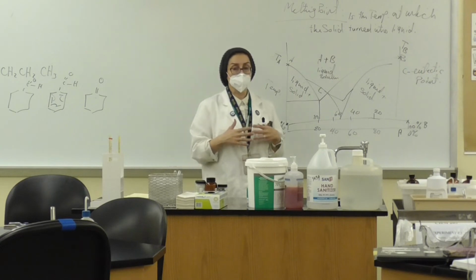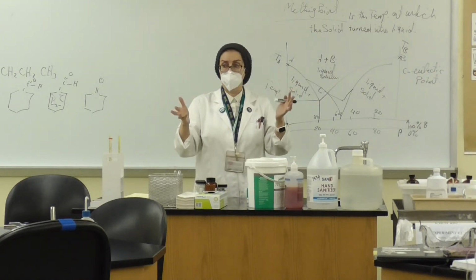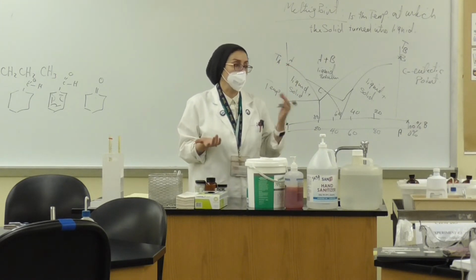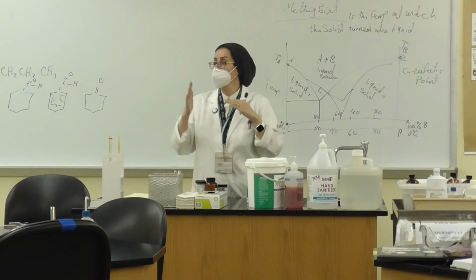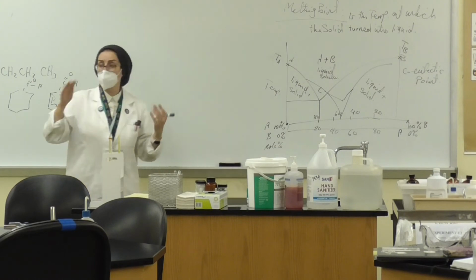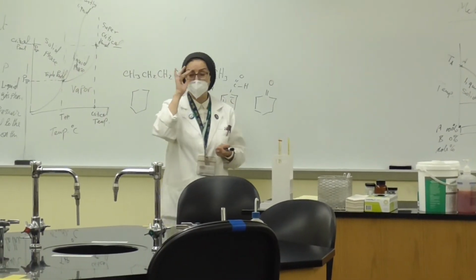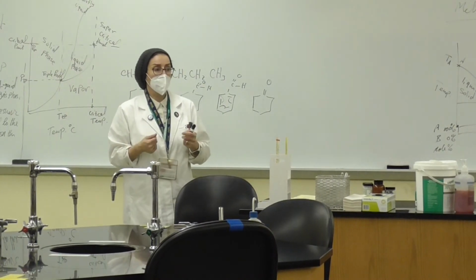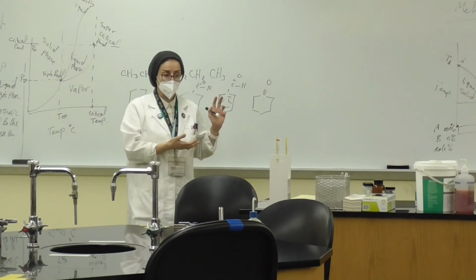When we have a very, very huge compound and it has a higher melting point, sometimes it is going to go beyond what we expect. So these are some of the obstacles that we might face when we measure those. So you have to be very careful, observe it, and make sure that you still have the chemicals, right? So this is what we are going to address today.